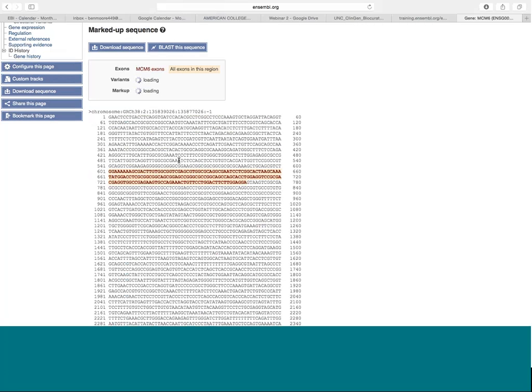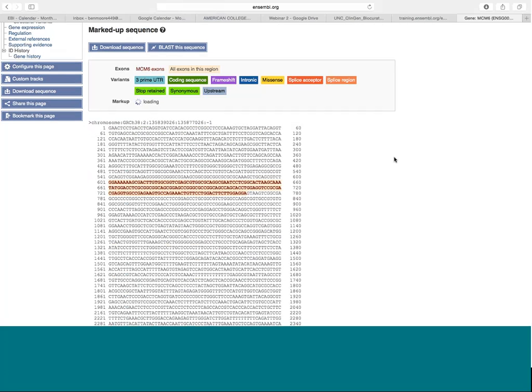You can hover and click on the variants on the sequence, but then for each line there's also going to be a list of links that link out to the variant tab for each variant. So if we had, for example, 5 positions in this line where we had observed a variant, there'd be 5 links here in the side that would correspond with the variants loaded there. Hopefully this doesn't take too long. I don't want to waste time. Okay, it's beginning to load now.